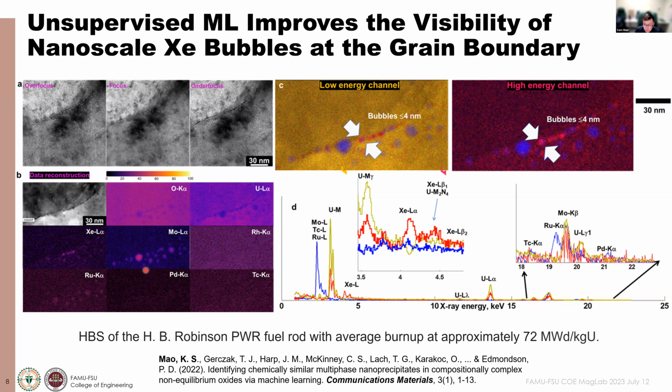This way, you can be very confident that what you are extracting from the data is precise, especially when looking at these grain boundaries. There are a lot of things in niobium alloys as well, and you can easily apply this method there too.